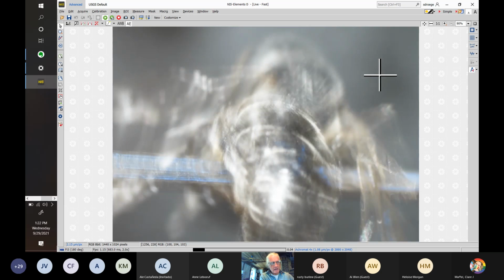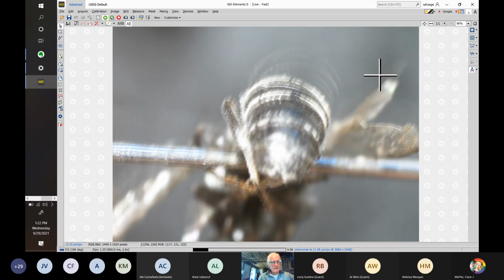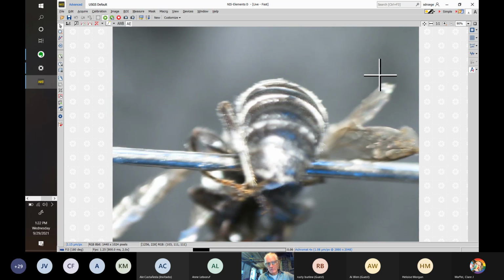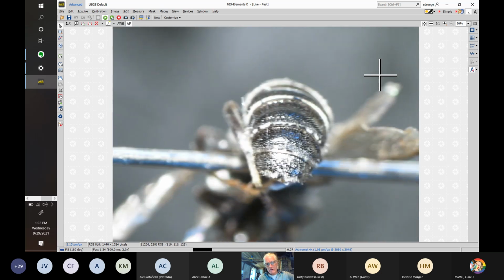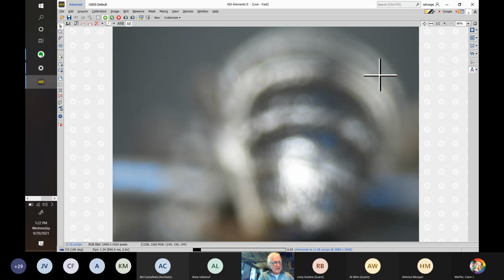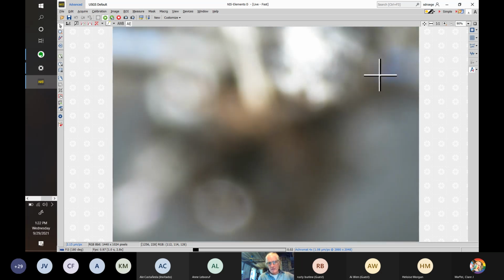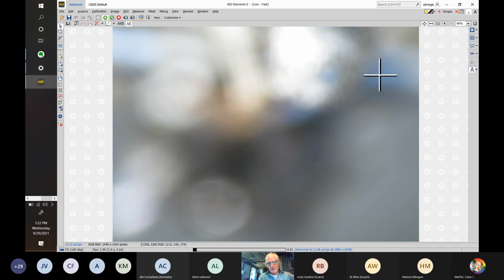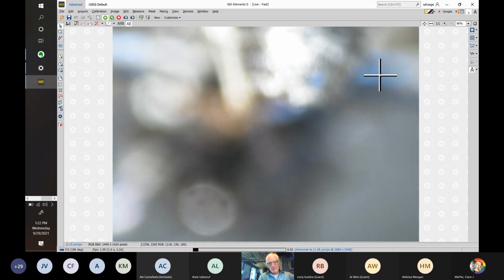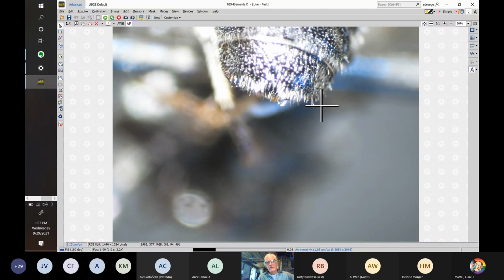Yeah, we can see it. Okay. Just bring it up a little bit higher on the screen. All right, it will shift to the rear end. And in the males, as was pointed out there before, there's some kind of teeth at the rear end. So we're looking at a male right now. Yeah, we're looking at a male. And Ashmeadiella opuntia, you can probably tell what it specializes on. And there are two lateral ones here.